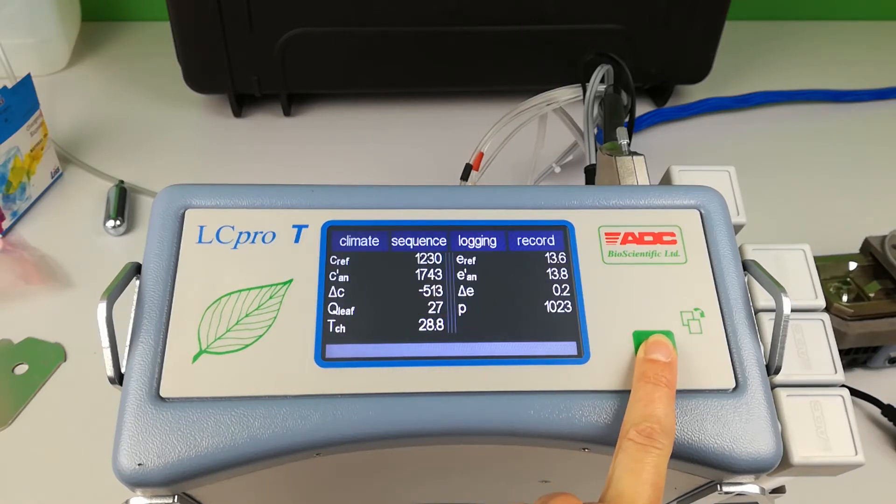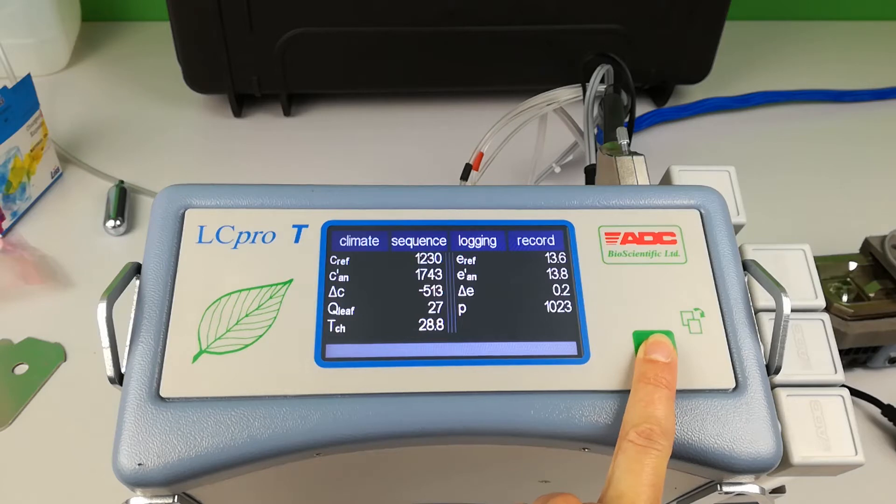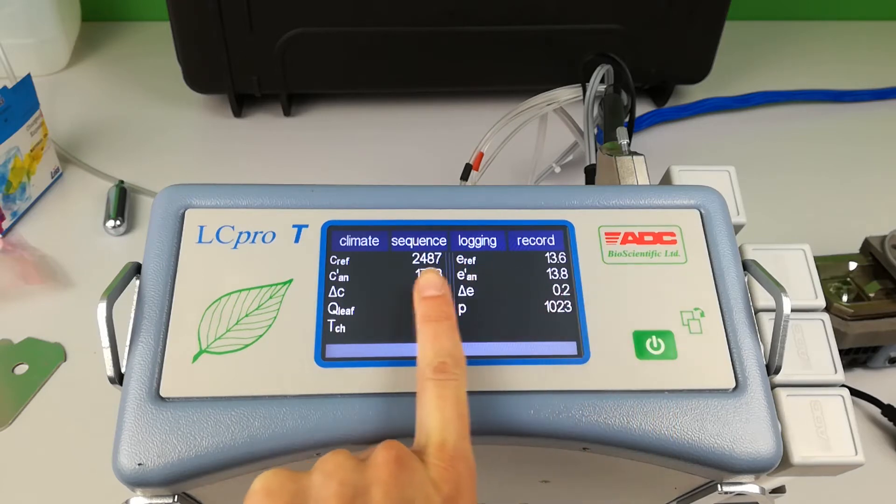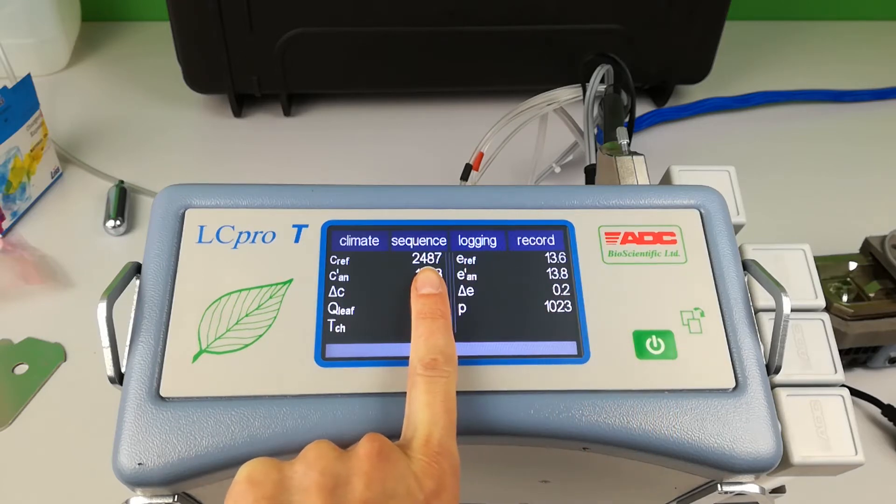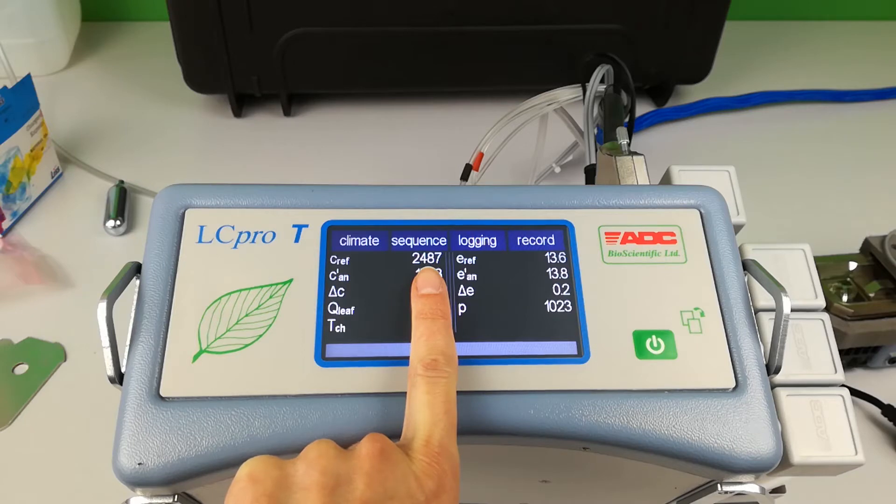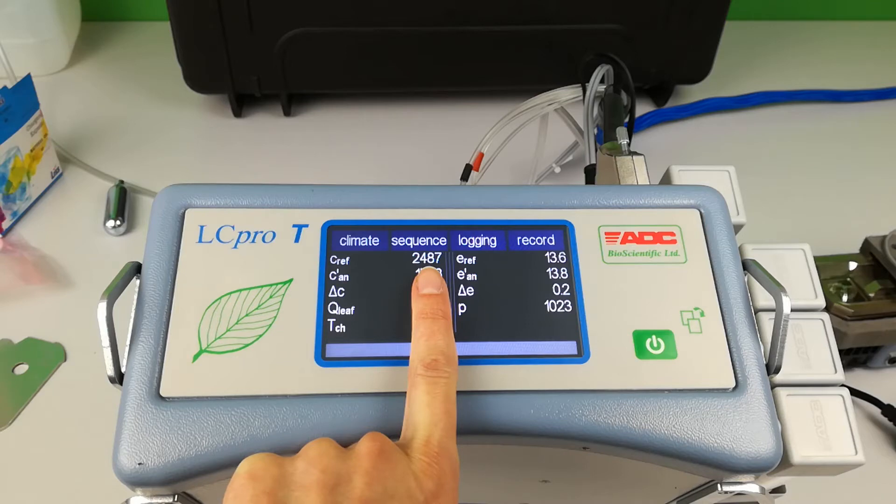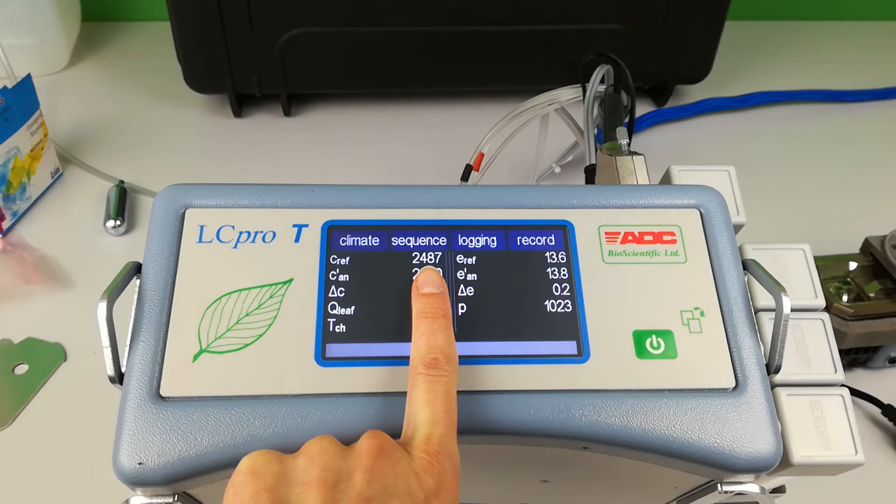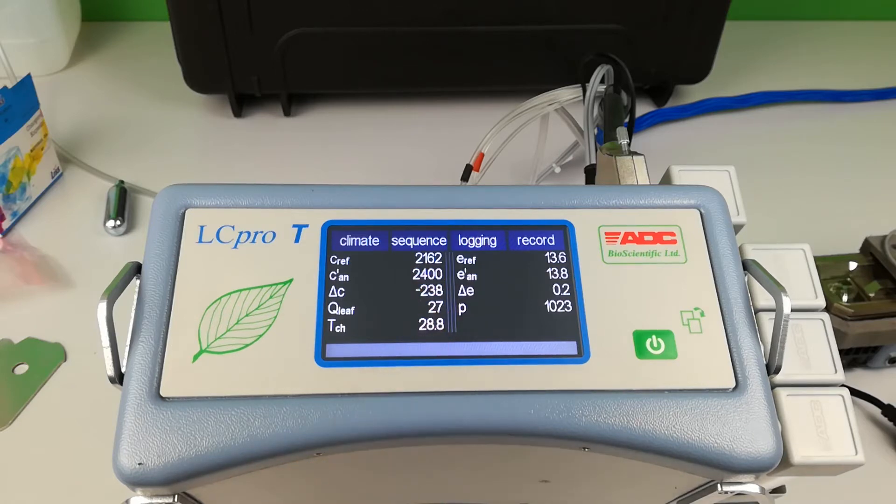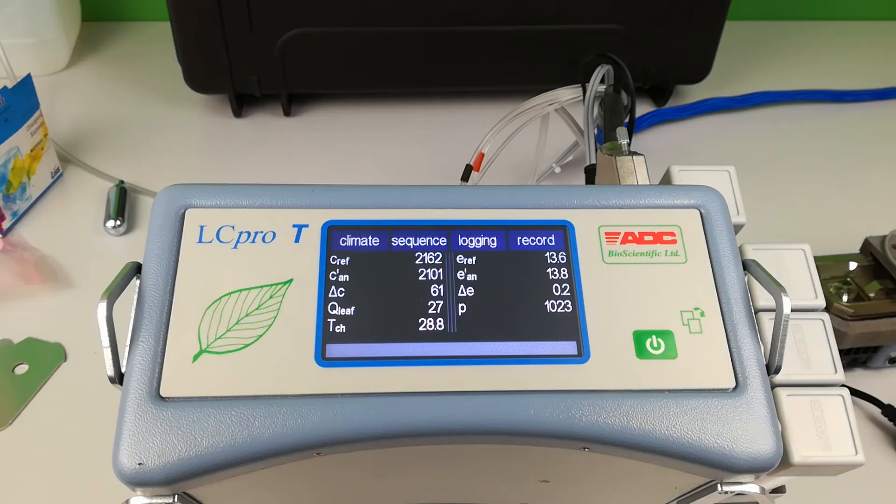Here you can see the C reference value, which will gradually reach the set value. This is achieved using a mixture of the CO2 from the cartridge and the ambient air through the reference tubing. Monitor this value either using the screen or by setting a graph.